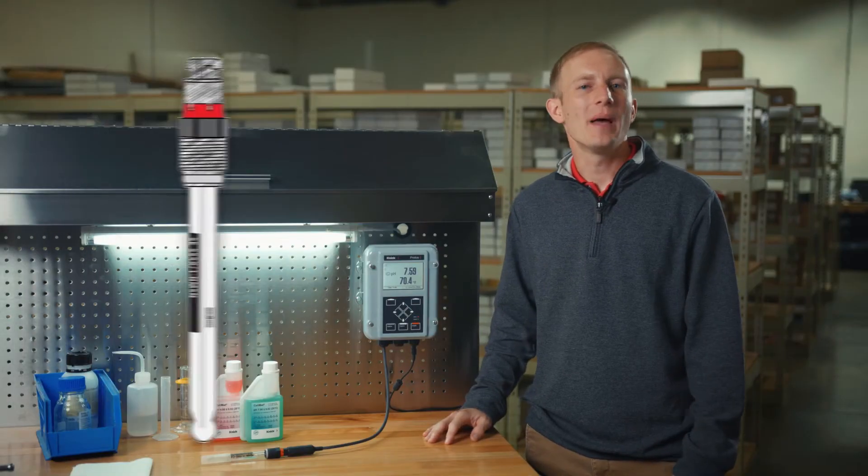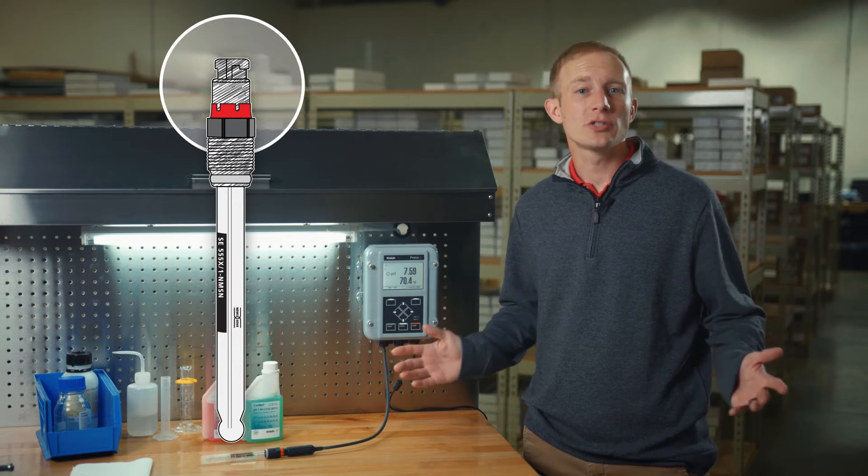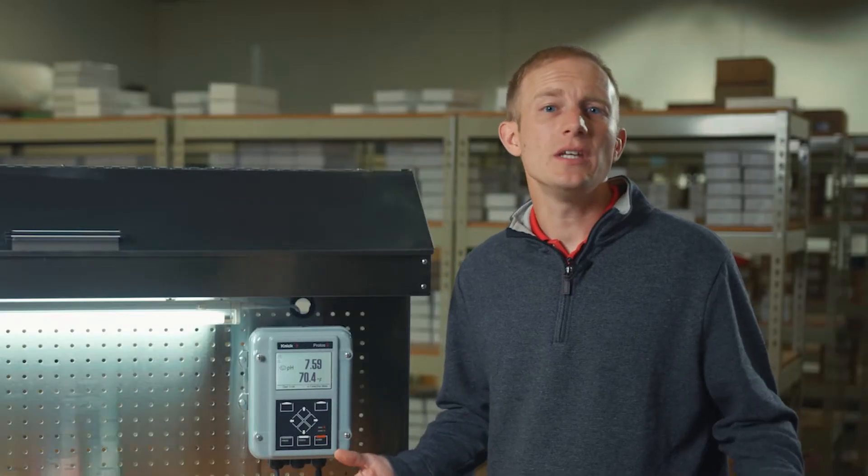As our connected sensor is a MemoSense smart digital sensor, the calibration will be written and stored in the head of the sensor. However, these same steps can be utilized when performing a calibration in the field.